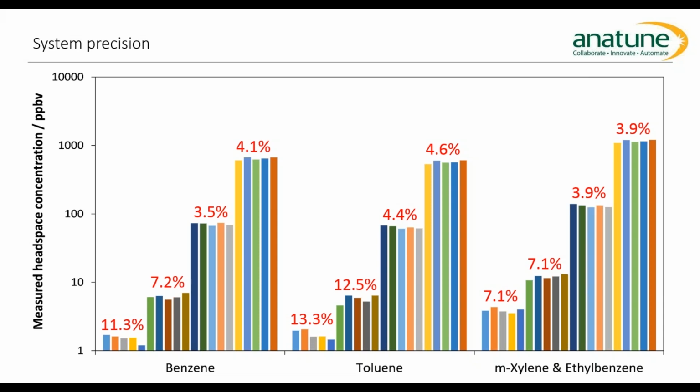Next part of the validation, again looking at system precision, so how precise are the measurements we make on this. Again, generating different concentrations of standards, this time in solution. So these are 5 ppb, 20, 200 and 2000 ppb concentration solutions in aqueous, in a headspace, incubated and measured by SIFT-MS, and we're doing repeat measurements, 5 repeat measurements for each of those samples.